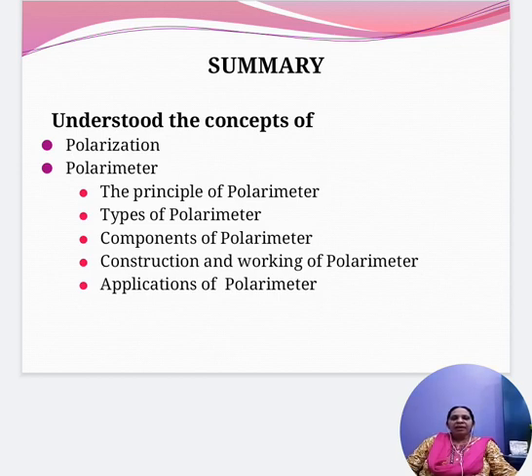We have polarized and unpolarized light, and the process of transforming unpolarized light into polarized light is known as polarization.